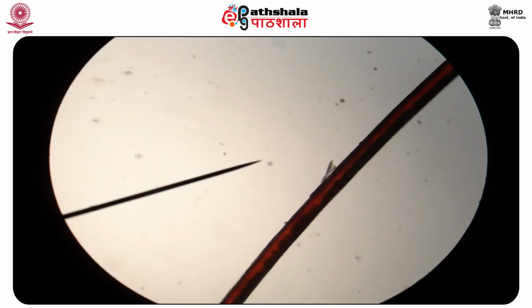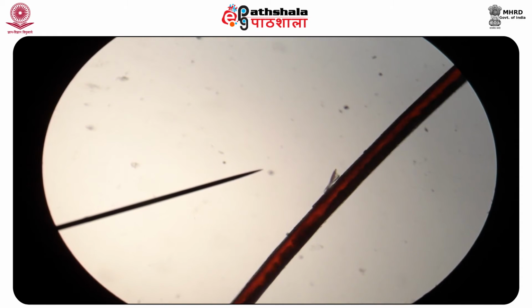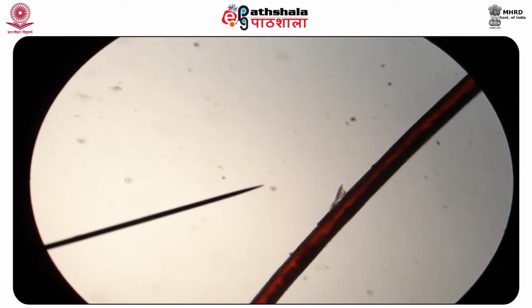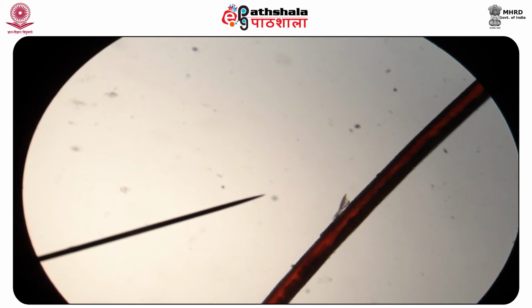The various types of microscopes that are used for the examination of hair are: first, the stereoscopic microscope. For initial examination of mounted or unmounted hairs, stereoscopic microscopes are used with a magnification range of up to 100x. Next comes the transmitted light microscope.